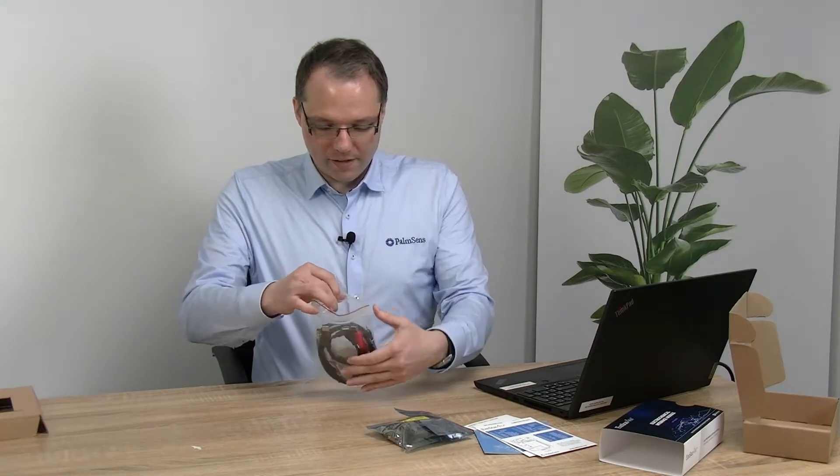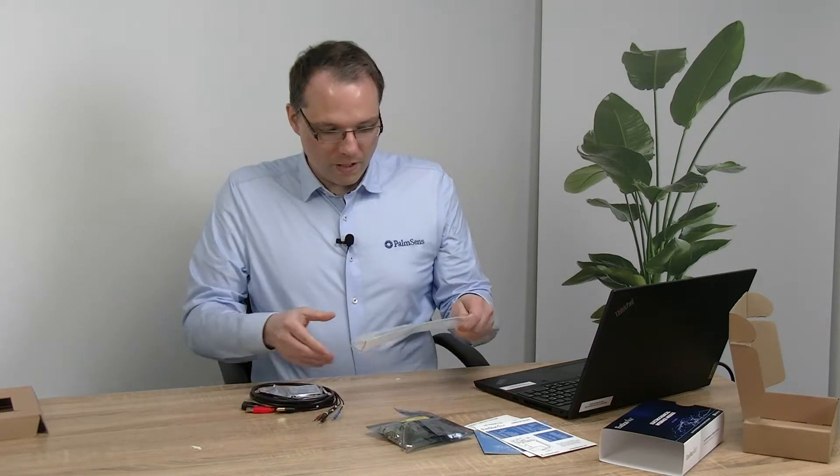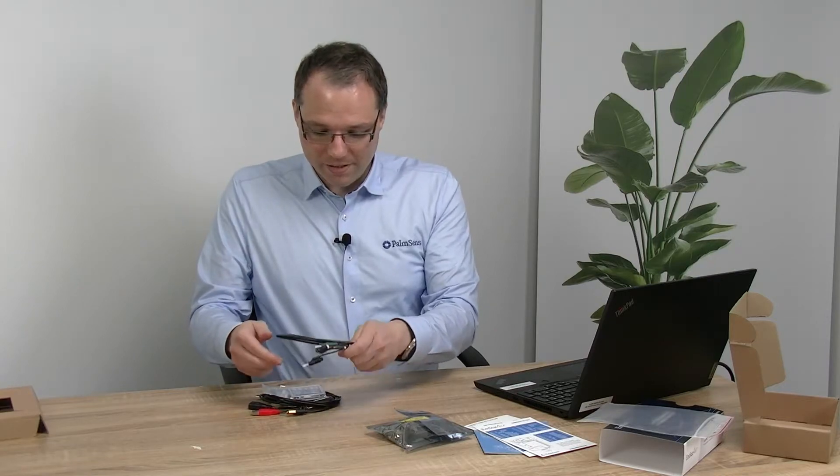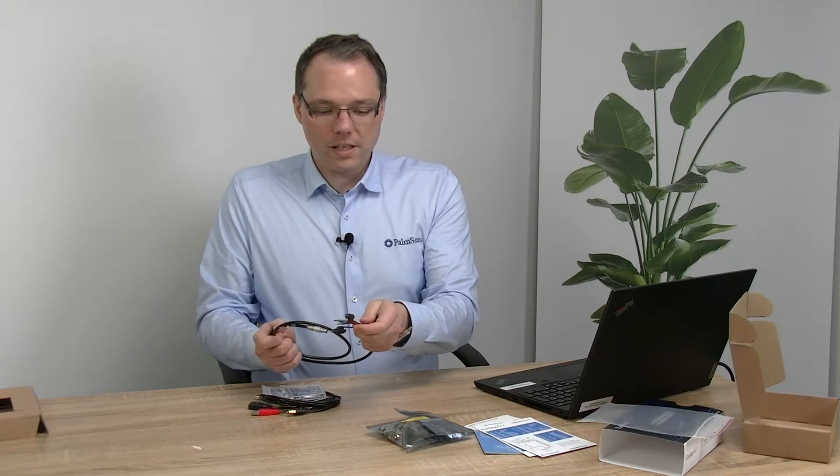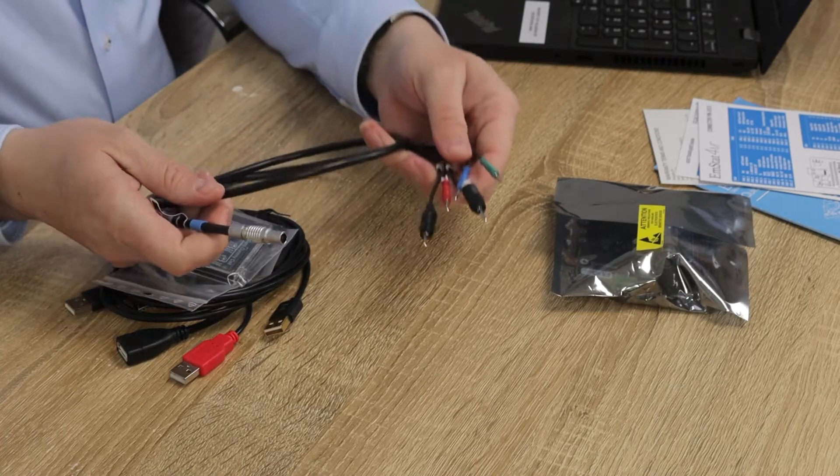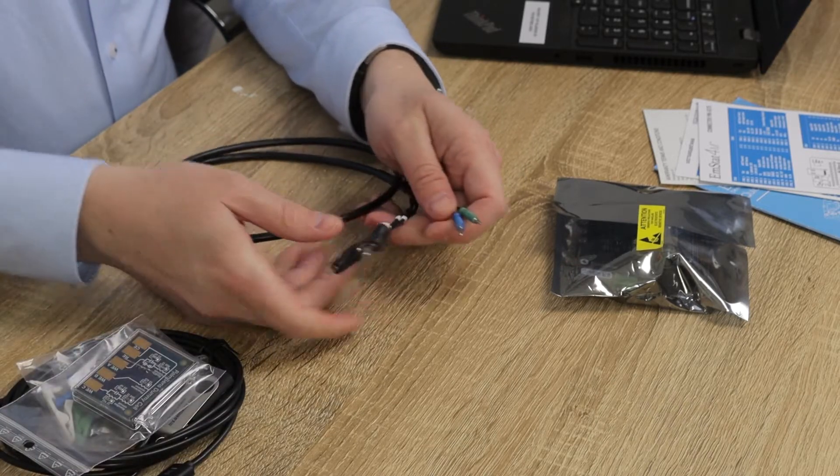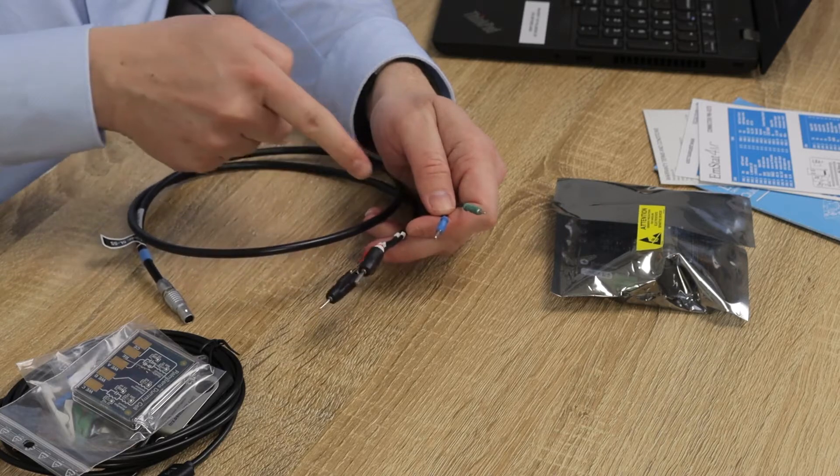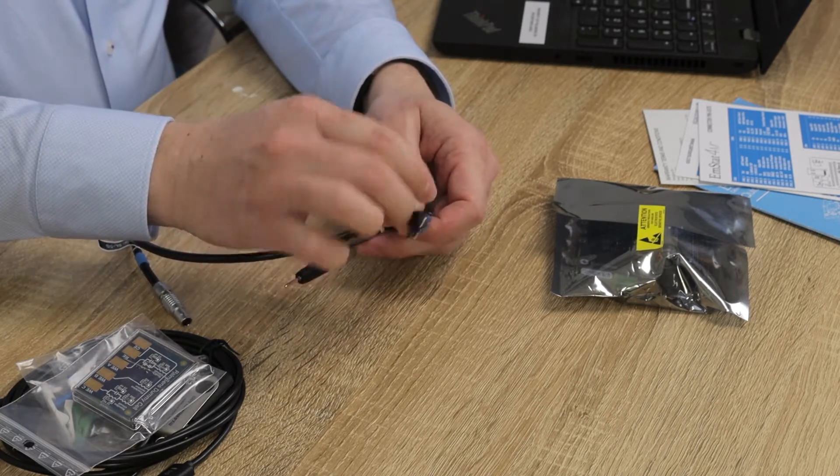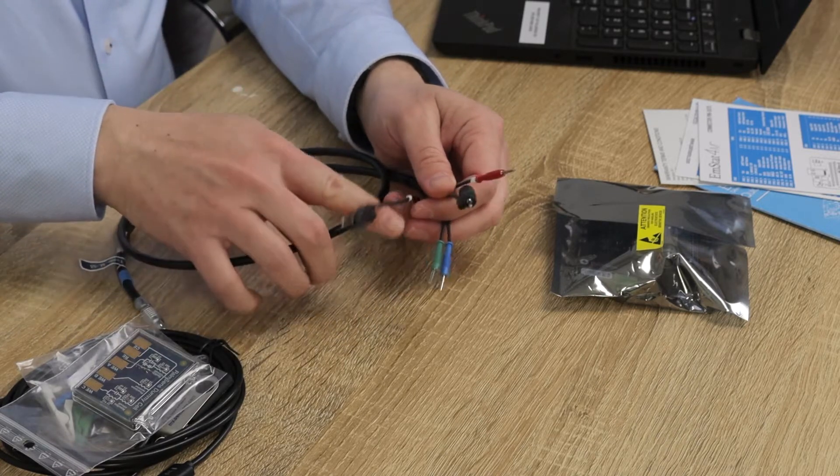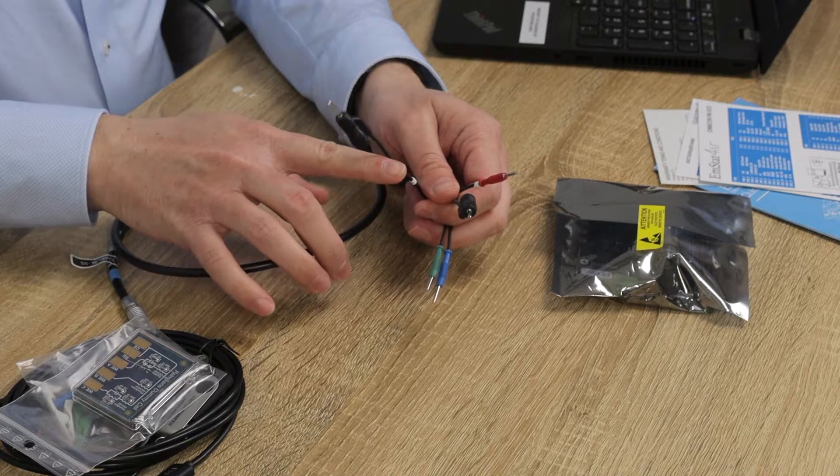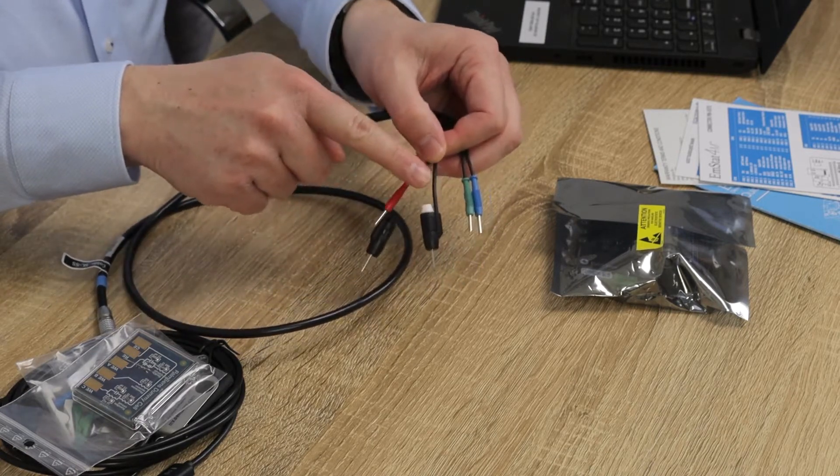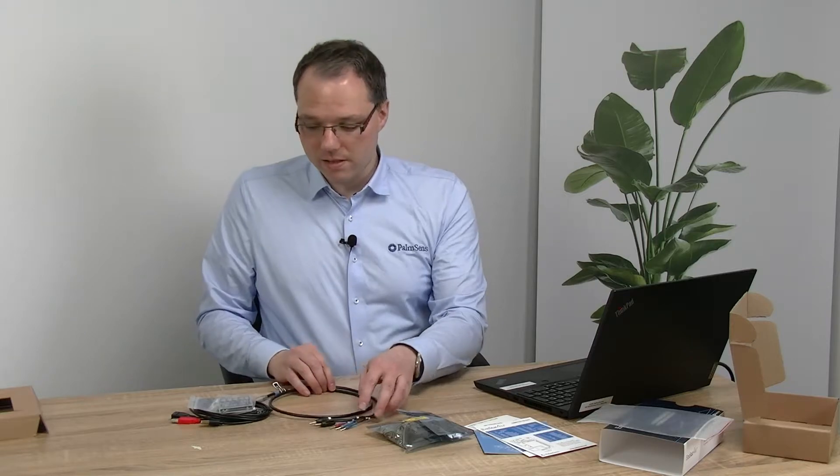Okay, what do we have in this box with multiple items? Well, it contains all the important cables. First you see the sensor cable—the cables that we use to connect our potentiostat to the electrodes. It ends in two millimeter banana plugs. It has a green plug for the ground, a blue plug for the reference electrode, a red plug for the working electrode, a black stackable one for the counter electrode, and a white one for the sense lead, because this is the high range version of the EmStat 4M which can go up to 200 milliampere, so you need a sense lead to compensate for cable resistance.